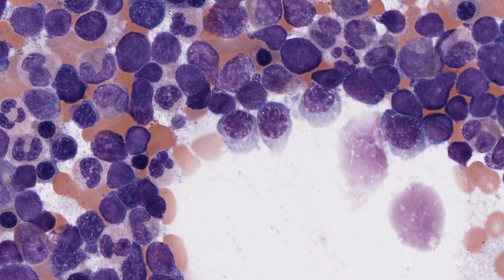Here is a higher magnification image where nucleated cells form an almost continuous pavement of cells one deep. I'll first describe erythropoiesis, the lineage that gives rise to our red blood cells, those very important cells that transport oxygen and carbon dioxide throughout the body within blood vessels. There are a number of stages in erythropoiesis, and again, let me stress they arise from the erythrocyte progenitor cell.